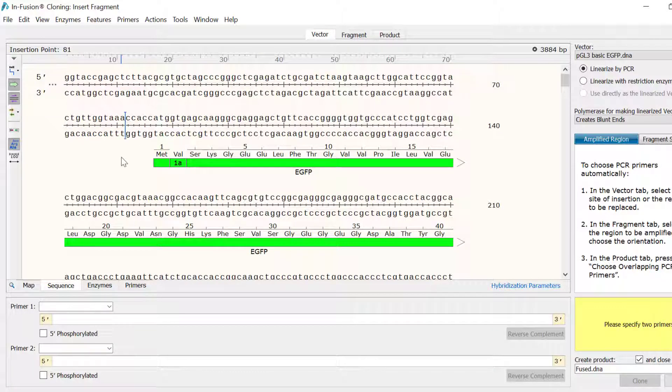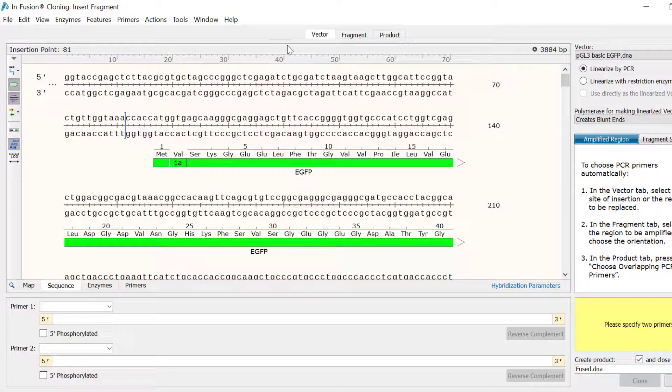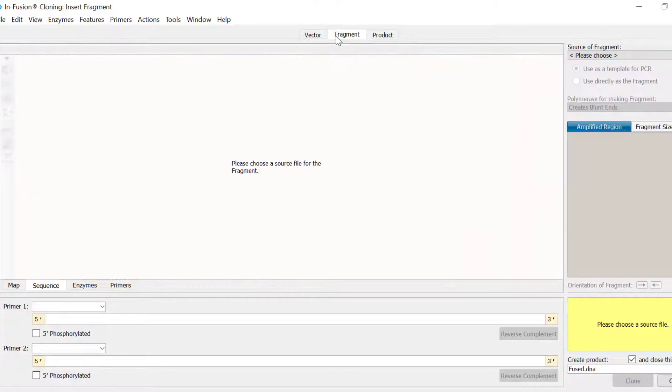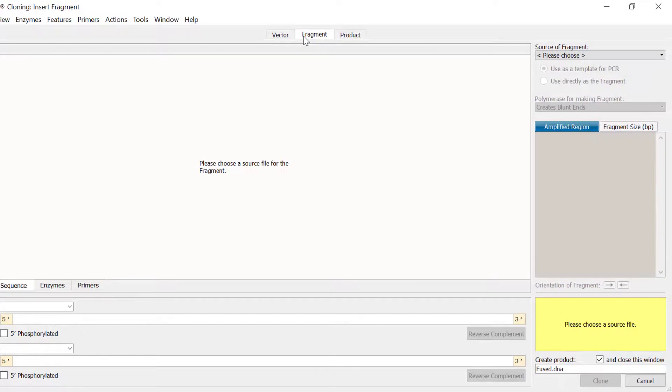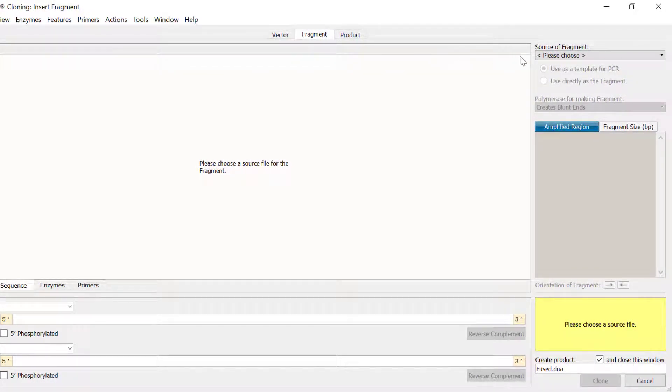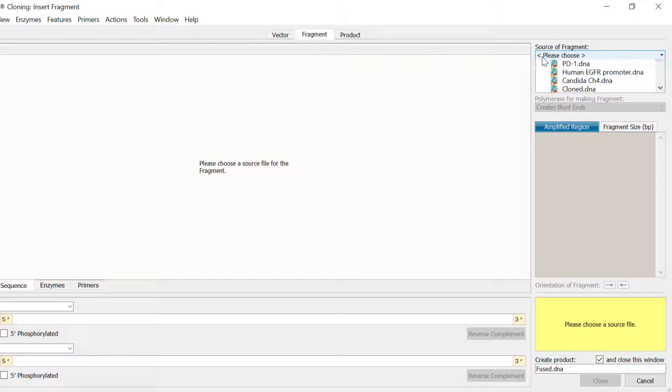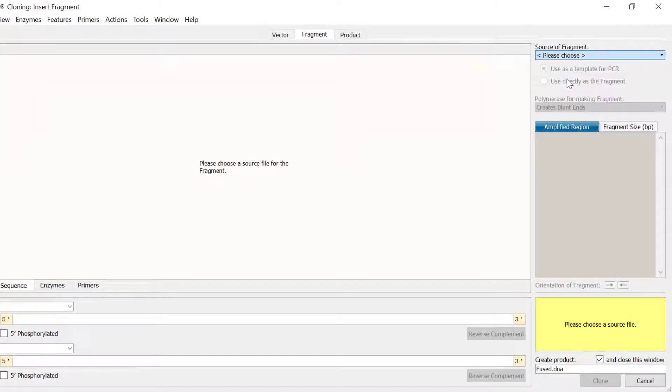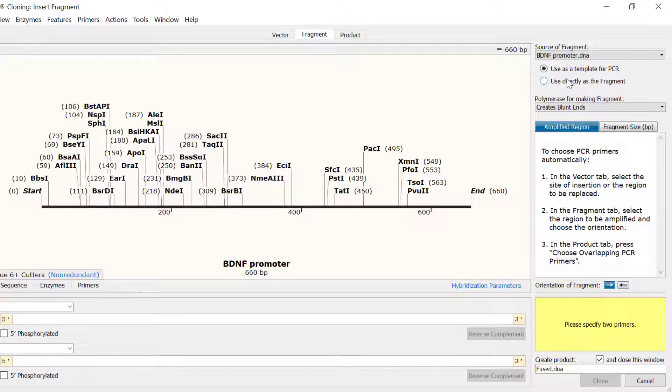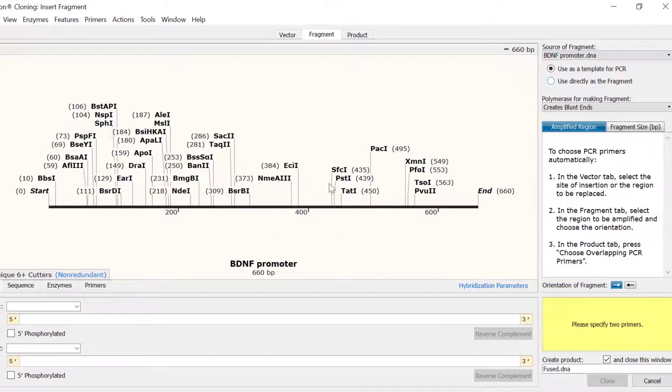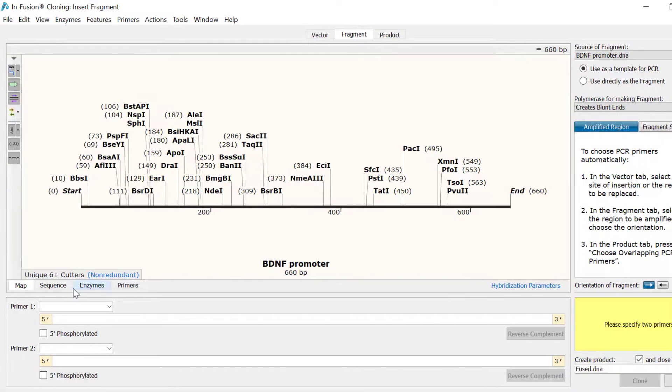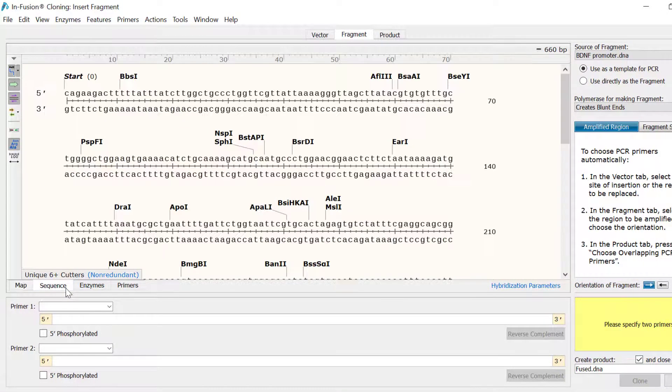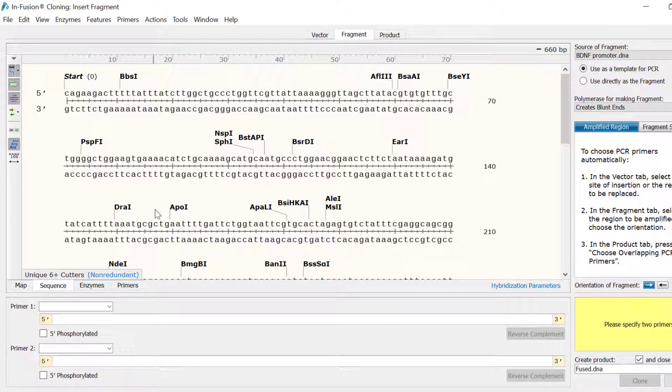In the next tab named Fragment, I need to select the file containing the insert of interest. This will be my BDNF promoter file. Again, simply use the dropdown menu to the right to select the desired file. To specify the region to be inserted, I will again switch to the sequence view and highlight the region of interest.